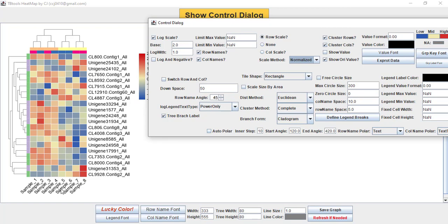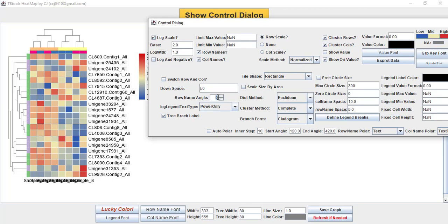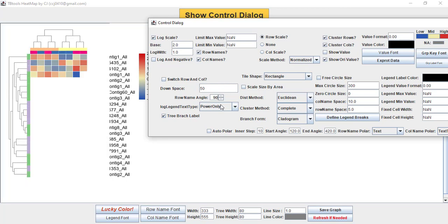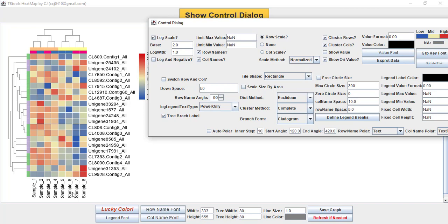Similarly, if you want to change the angle of your sample names — you can see they are currently in tilted form — just change the angle from the row name angle option to the degree you want. Here I put 0 so it changes to horizontal, but because our sample names are long they merge with each other. So I am putting 90 and then you see they are vertically arranged.